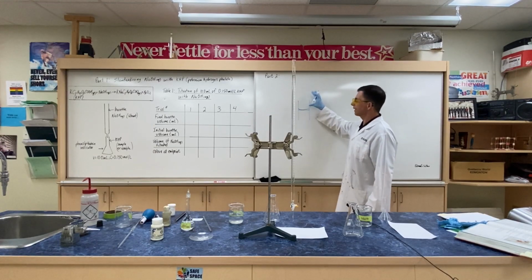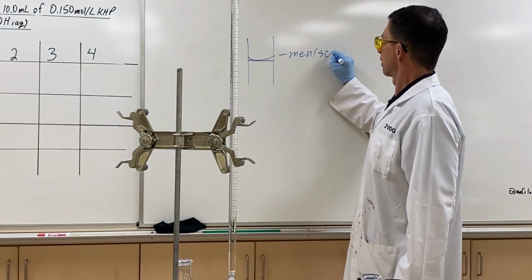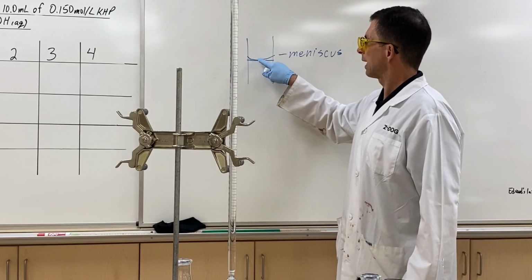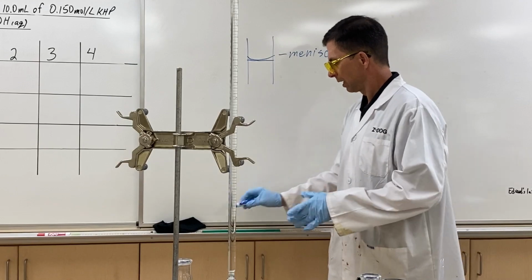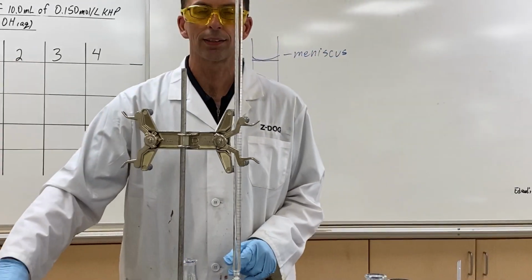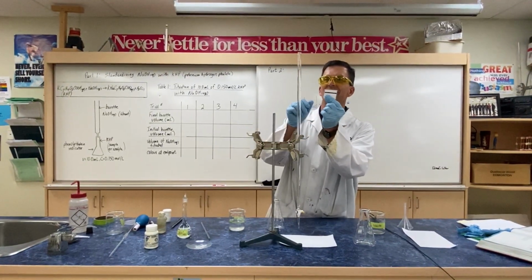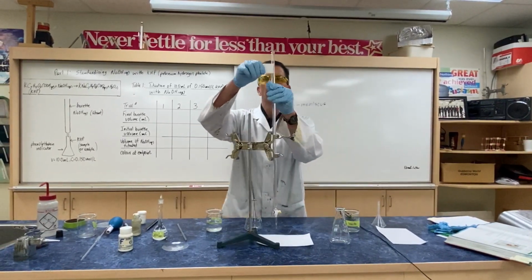Whenever you place a liquid into a tube, it forms a curved surface called the meniscus. And we always read the meniscus at eye level, to the bottom of the curved surface, to avoid parallax. And a pro tip is to use this meniscus finder. It's a card with a black line at the bottom.